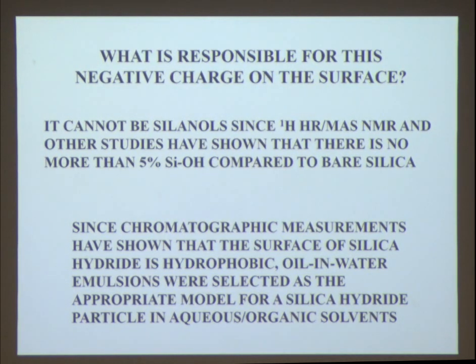So we started searching around in the literature trying to figure out an explanation for this, and we came up with a very interesting series of papers. Some people did some experiments on oil drops, and they put oil drops into a water organic solution, and they discovered the same thing. The surface of that oil drop became negatively charged.